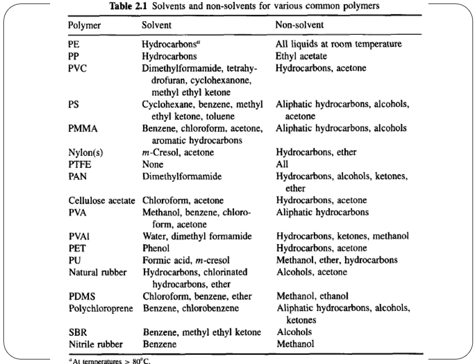For example, the polyethylene is soluble in all hydrocarbons. Polypropylene is also soluble in hydrocarbons. PVC is easily soluble in dimethyl formamide, tetrahydrofuran, cyclohexanone, methyl ethyl ketones, etc. If the obtained sample is soluble in these solvents, we can assume that the sample may contain PVC. Similarly, there are a number of other solvents which are specific to the polymers especially.